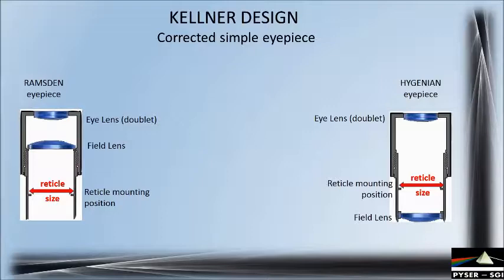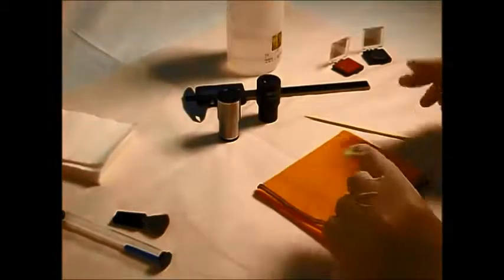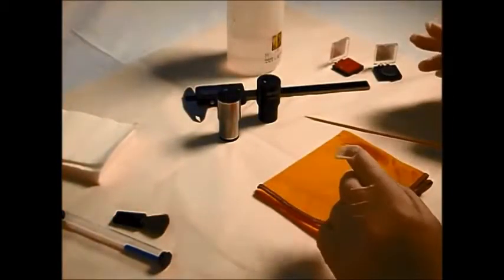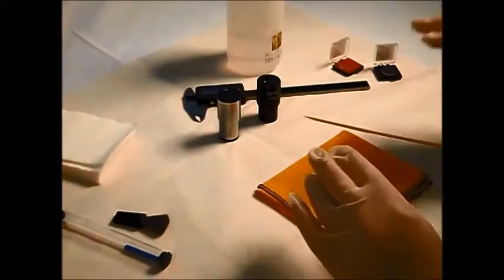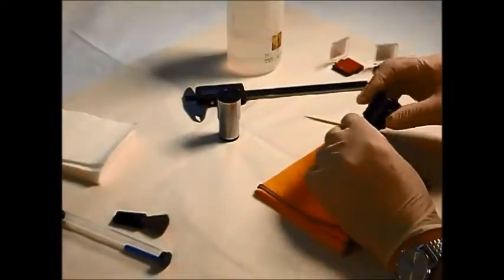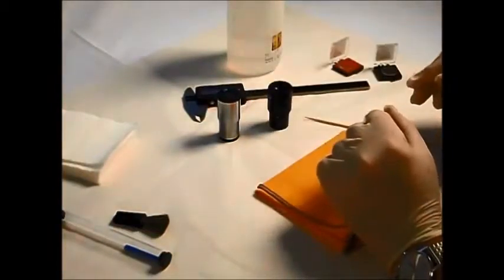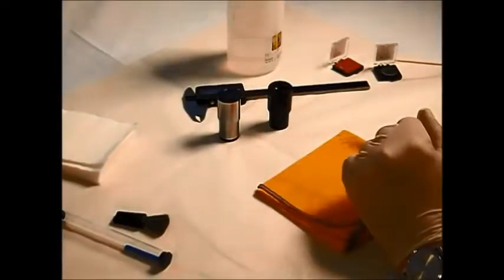So let's look at how the task is done. We're going to fit some reticules into the 2 eyepieces we have here. The most important thing when doing this job is keeping the new reticule and the eyepiece assembly clean and free from dust, dirt, fingerprints. It's very important. There's nothing more distracting than a small piece of contamination obscuring the view, especially when you know you're the one that put it there. The lines on the reticule are 15 microns in thickness.